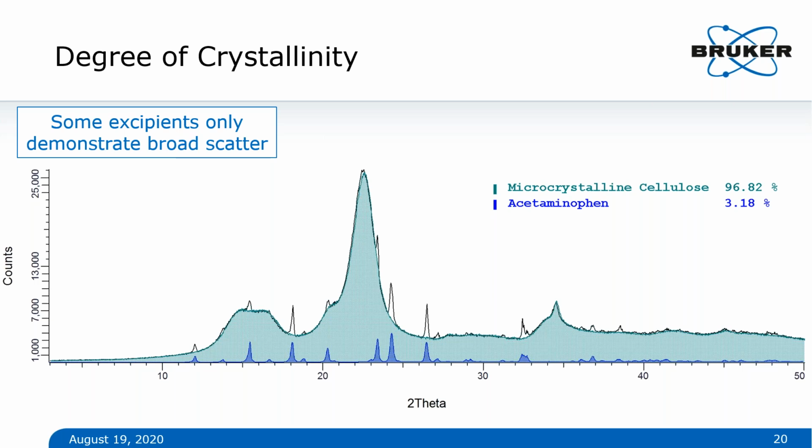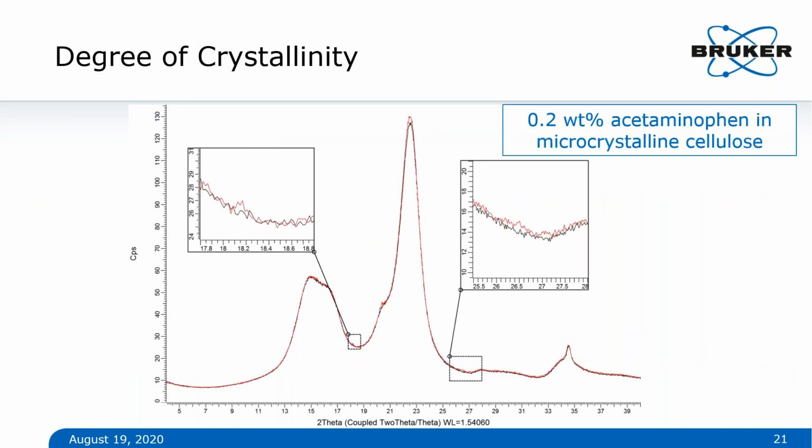Fantastic. I have another great question that just came in. For low percent crystalline detection, do you use signal to noise or another means to define the limit?